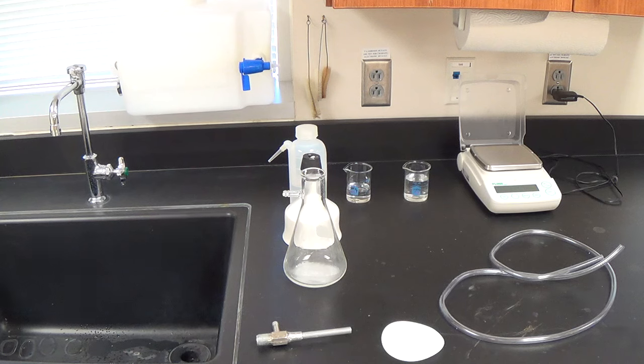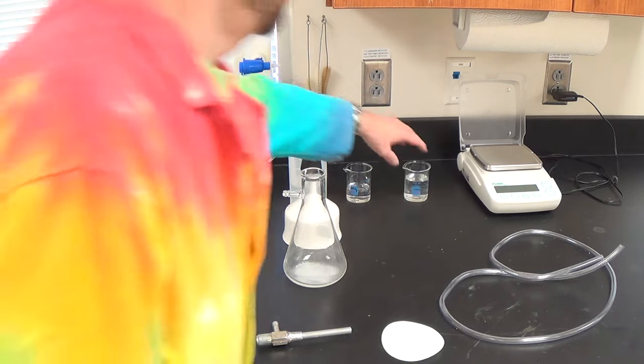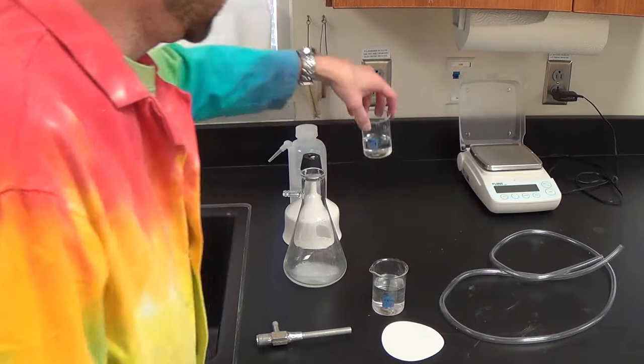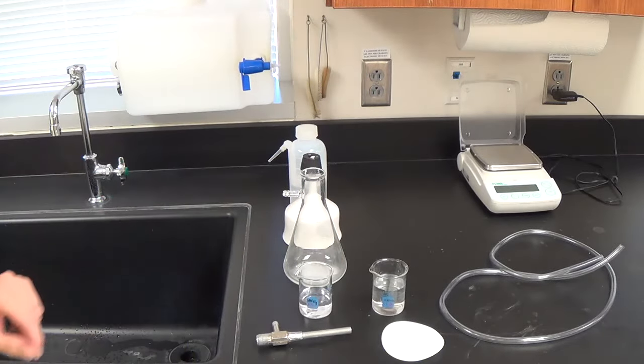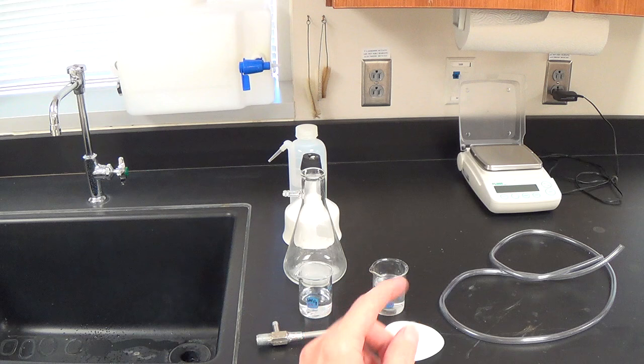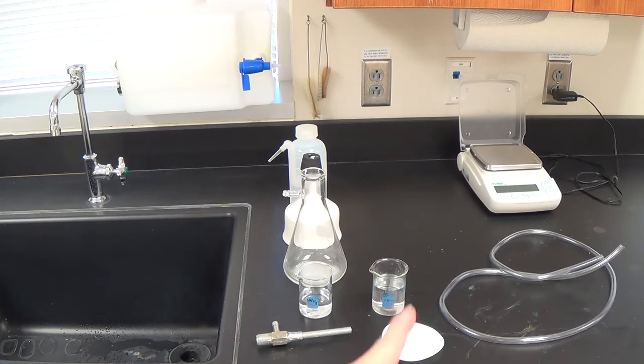We have a sample of tap water, and we have a sample of sodium carbonate. We know we've measured how much sodium carbonate, we've measured how much tap water. We don't know the molarity of the calcium ions in there. We will know the molarity of the carbonate ions in there because you have measured and can therefore calculate what the molarity is there.